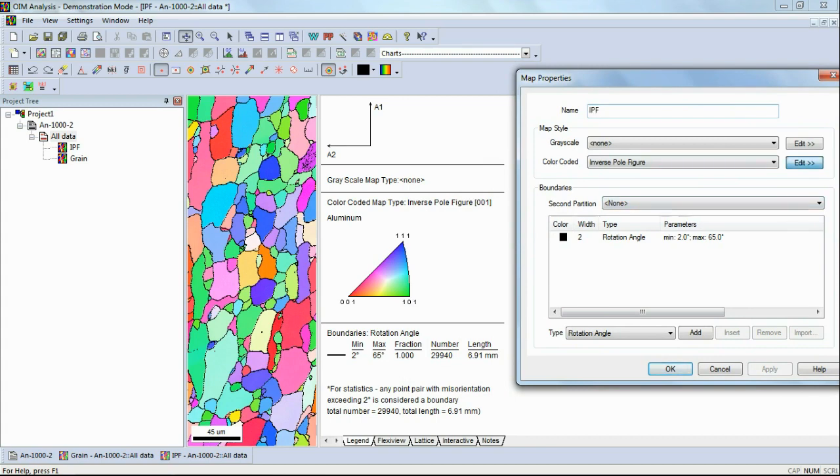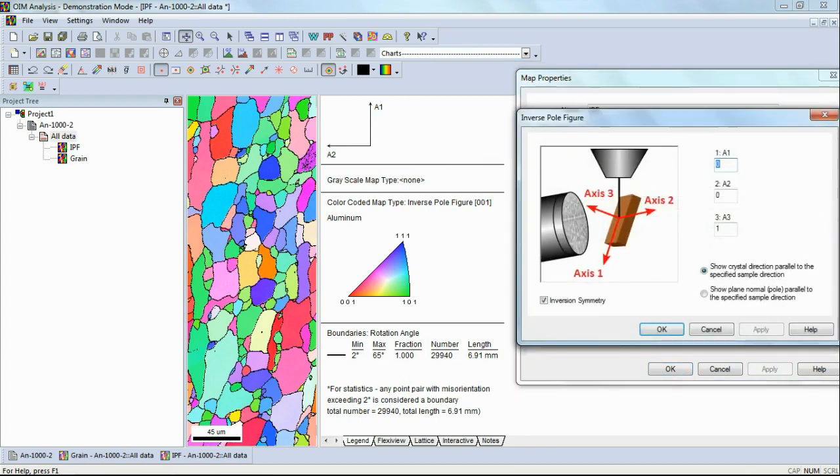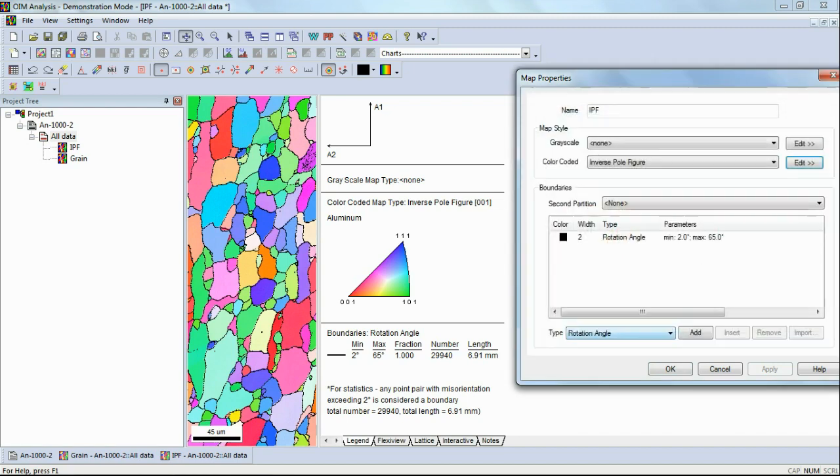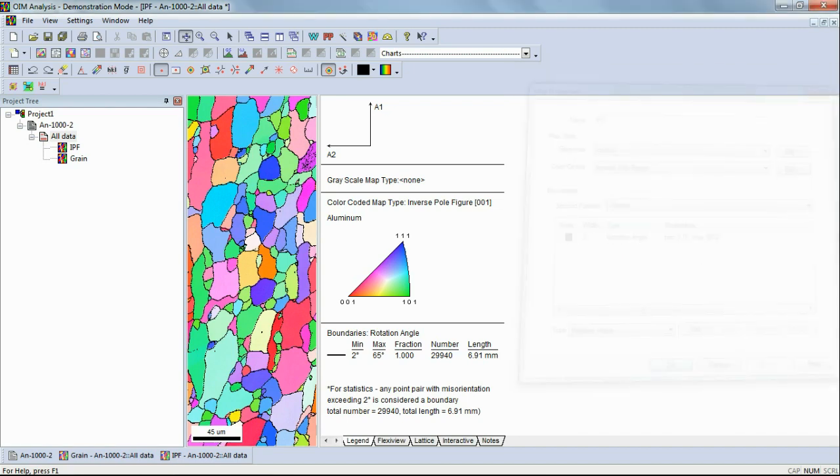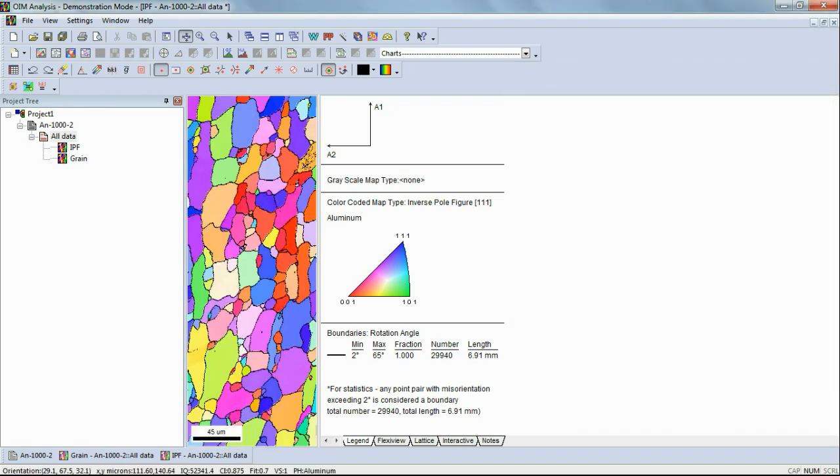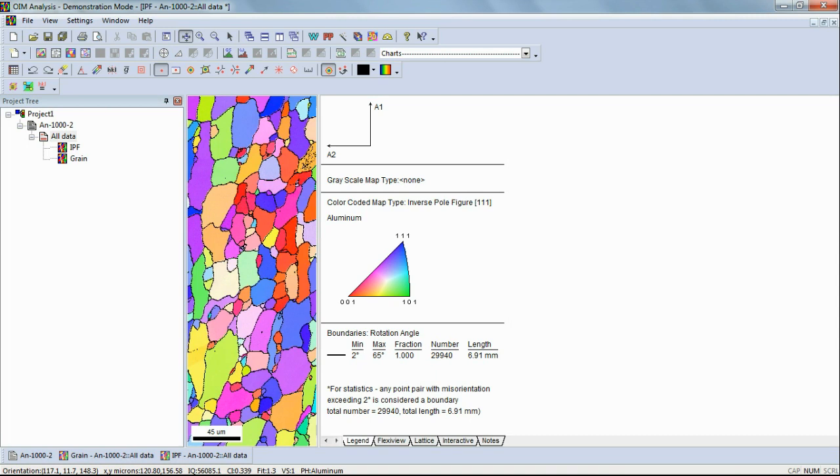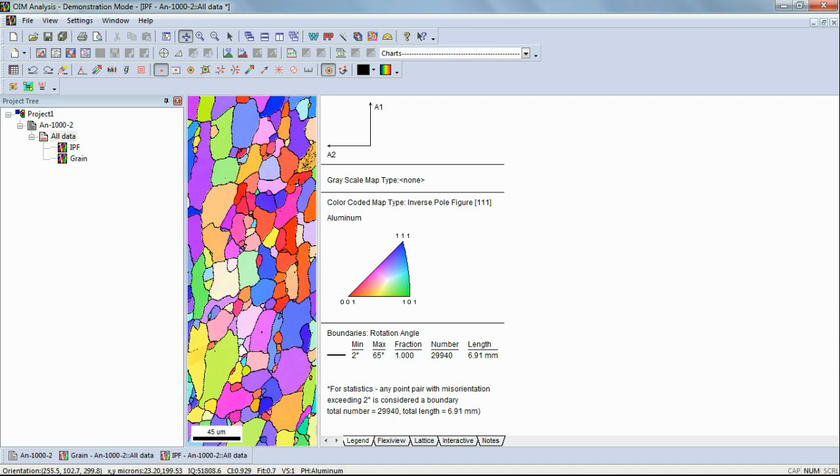Determine the correct axis or point of view according to the crystal structure. In this case, you will see the right orientation of the grains.